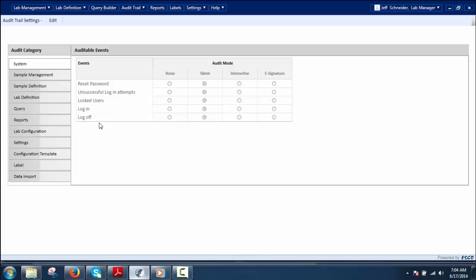Silent means this type of audit trail monitors and logs activities silently without any intervention by the user. Interactive means the audit trail monitors activities and asks the reason for performing them. E-Signature means the user must authenticate themselves to perform the activity and provide the reason for performing it.